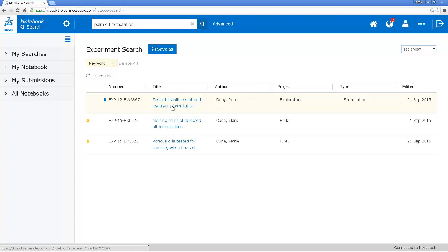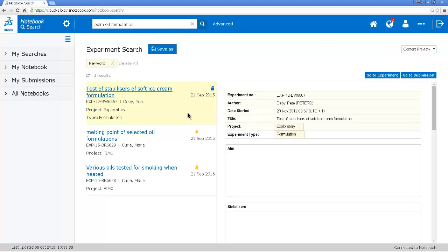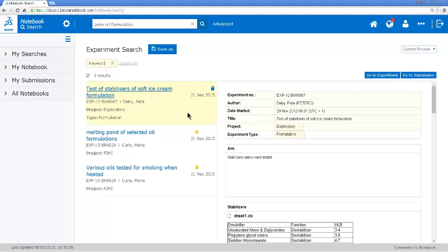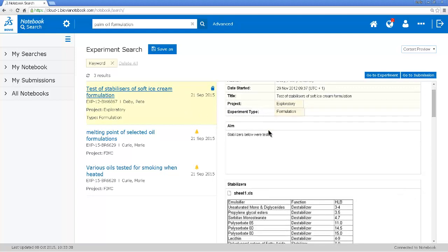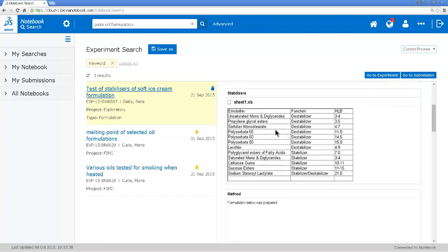Now I could open this experiment directly but also when you've done a search in the notebook and you've got a list of experiments you can actually go to a different view where you can see the content of the experiment directly here in the search results. It doesn't matter so much with only three experiments but if I had a list of 50 experiments it might be a lot quicker to browse through the different experiments.